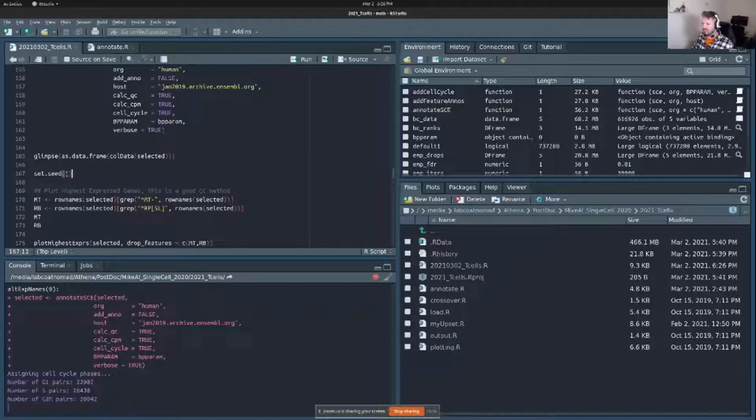Again, setting a seed. Doesn't matter really what the seed is. Maybe Henry can chime in, but I like to set a seed before every next step I do. And I do that because a lot of other packages reset your RStudio seed within whatever their package is. They might have a random number generator in theirs. They might have a set seed in some built-in functions.